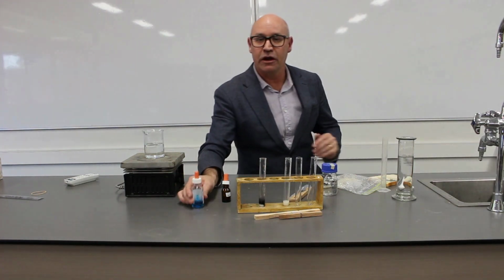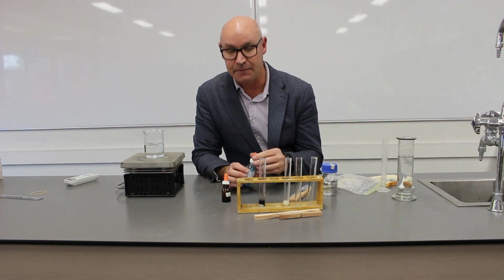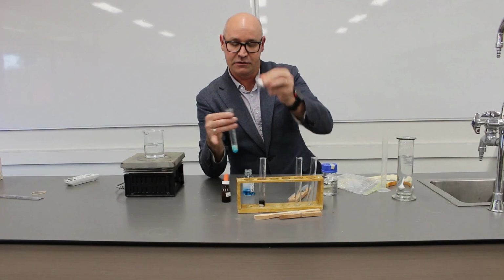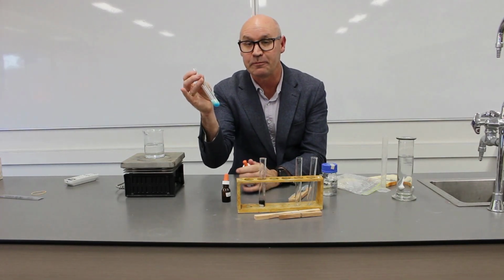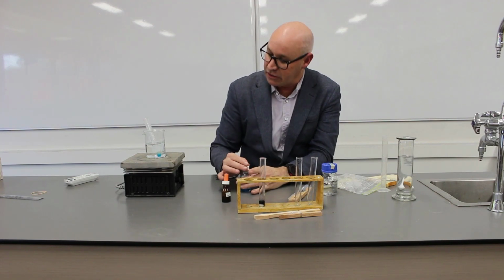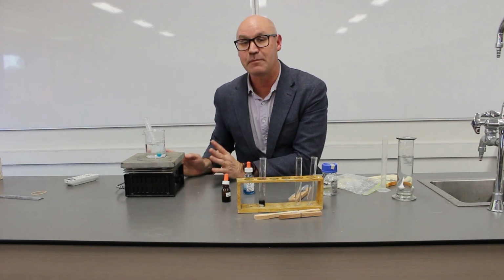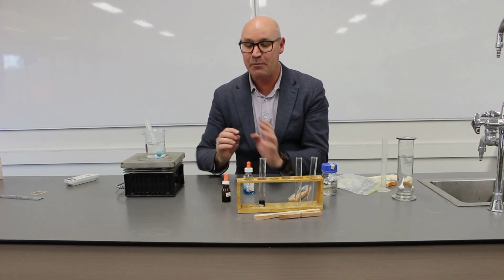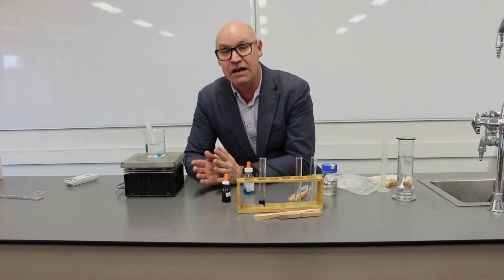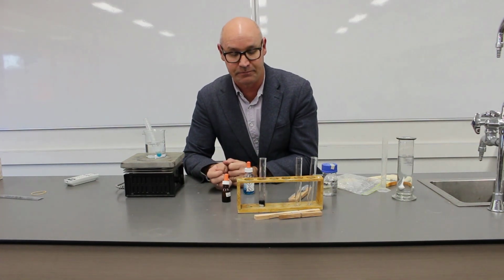The next test we're going to do is called Benedict's test. And it's a test for sugar. So we're going to take a squirt of the Benedict solution. As you can see, it's blue. And we're going to put this into our hot water on the hot plate. Now we need to leave it on here for around about 5 minutes. A positive test for sugar is a red brick precipitate. So I'm going to show you what that looks like very soon.